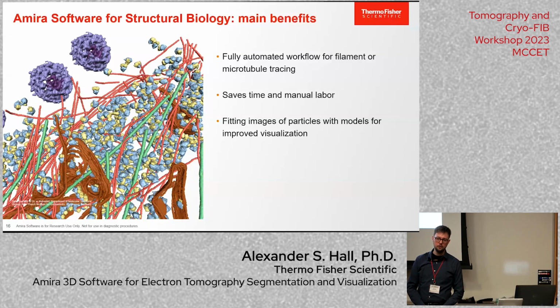We are very interested, I would say, as a company in going in the direction of this particle placement inside of the tomograms. We're not quite there yet. I think people in this audience are more knowledgeable of that space than I am. But it's really quite catered to your goal.